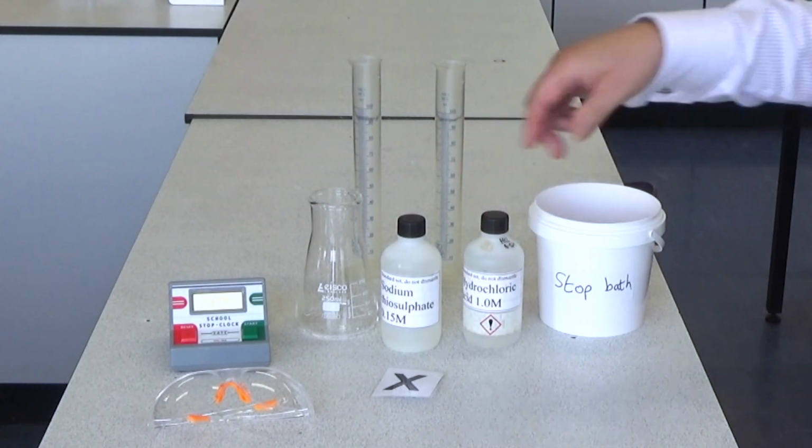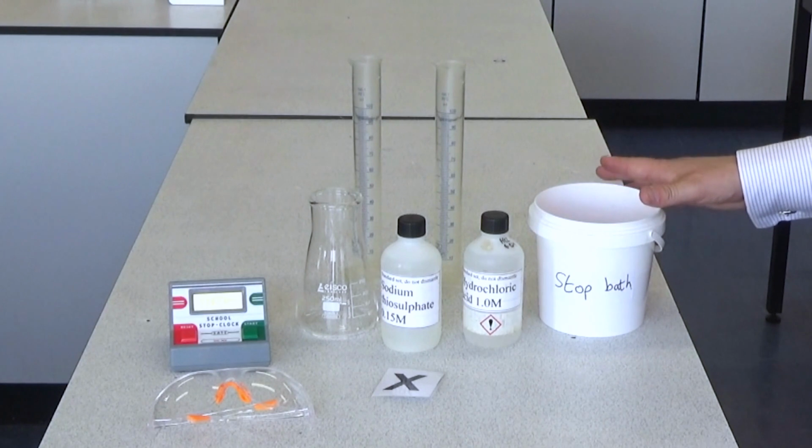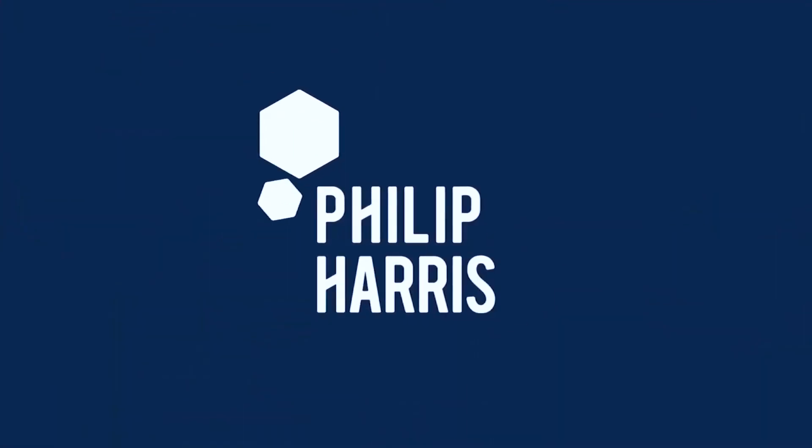hydrochloric acid. And when these react together, one of the products is sulfur dioxide gas, and to stop that gas building up too much in the air, we're going to pour any chemicals when we've used them into this stop bath, and that will stop the reaction. And there's instructions on the website of how to make up this stop bath.